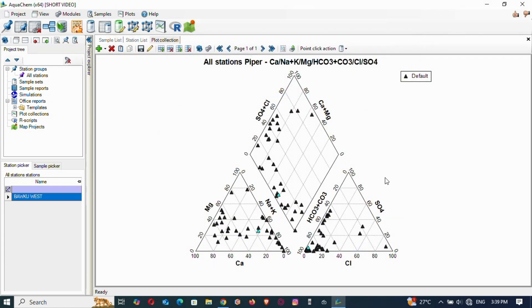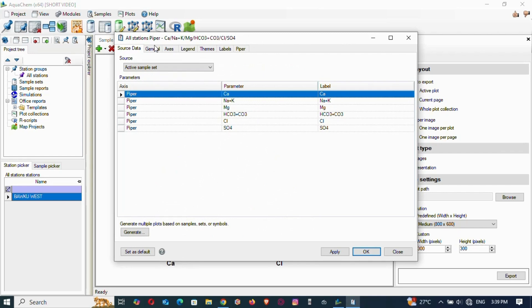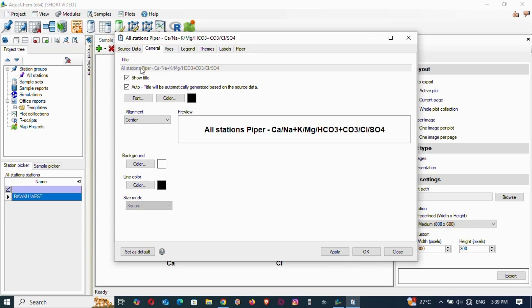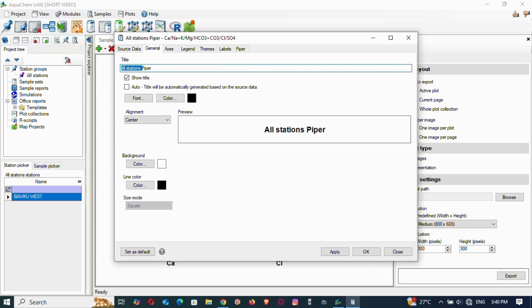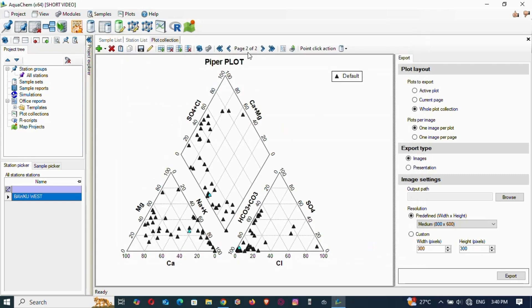There is the Piper plot — it's already done. Look at the caption; that may not be how you want it. Go to Select Piper again and under General, find the title. Untick 'Auto Title,' then edit it — type 'Piper Plot' or whatever you want. Choose alignment and colors as desired, then click Apply and OK.